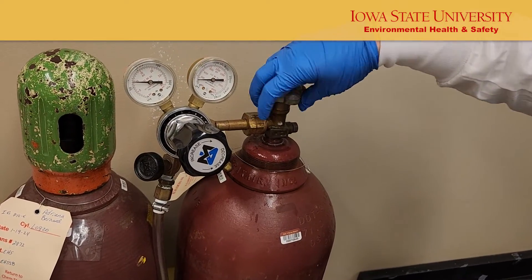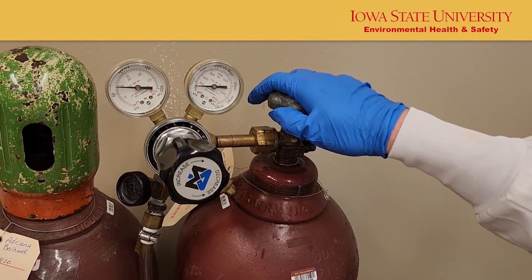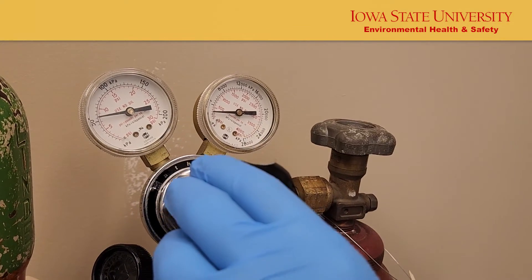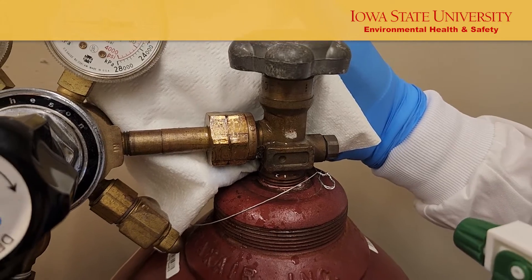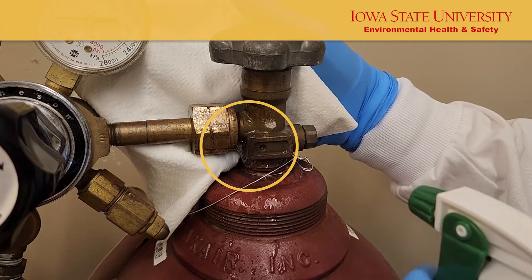Pressurize the regulator slowly by opening the main tank valve first. Ensure the valve outlets and regulators are pointed away from personnel when the cylinder valves are open. Adjust the secondary valve until the proper pressure has been achieved. Check the connection for leaks using either a bubble or pressure test, depending on the type of gas you are using.